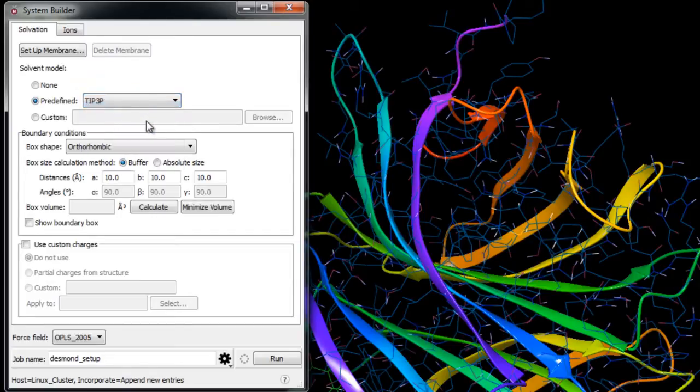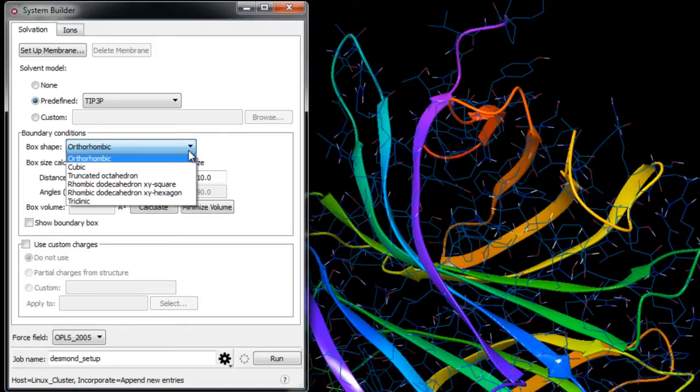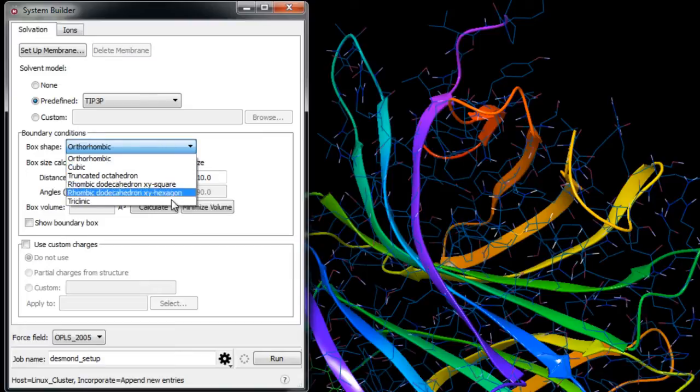Now the periodic boundary conditions are set up by specifying the shape and size of the repeating unit or box. Once you choose a box shape that will best fit the protein, in this case we'll just use the default orthorhombic.